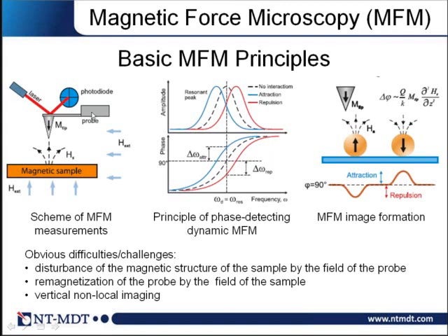The question is, what is the weight and dimension of the permanent magnet? Well, as I said, there is a standard device which is already ready to be bought. The diameter is 40 millimeters, the thickness is 12 millimeters, and the weight is about 100 grams.